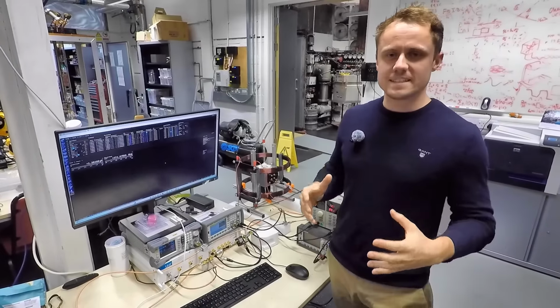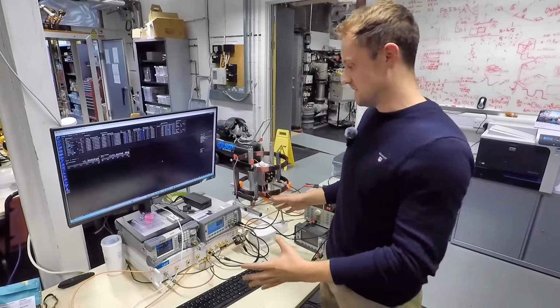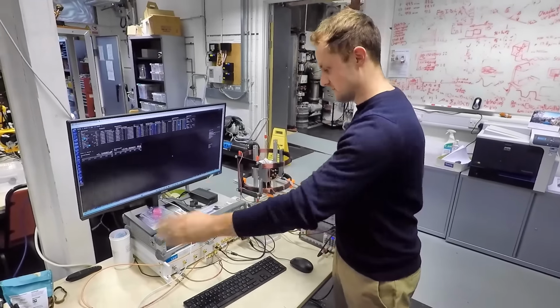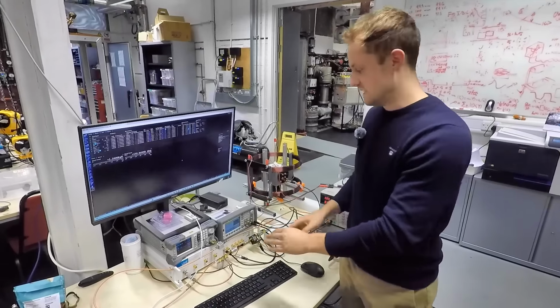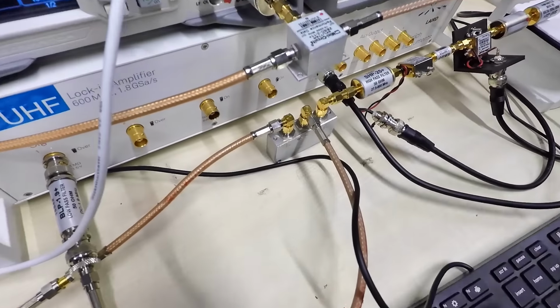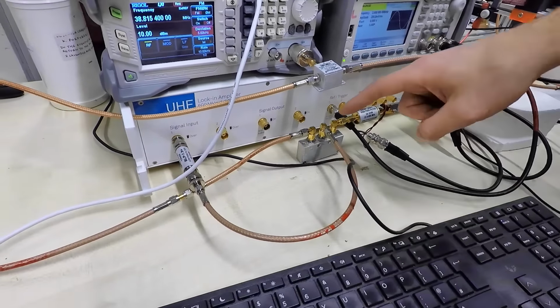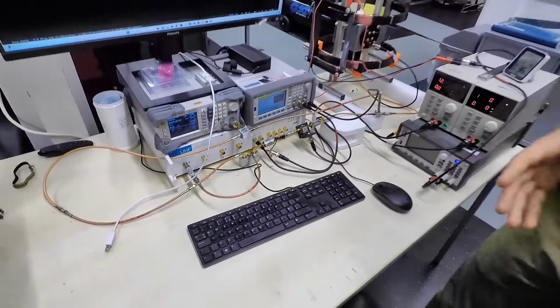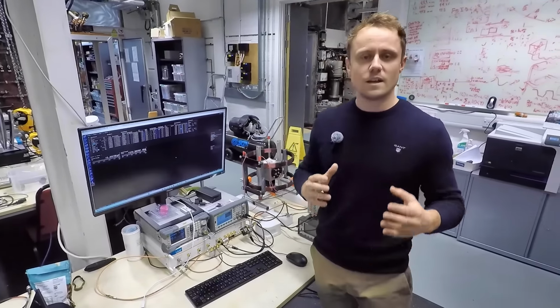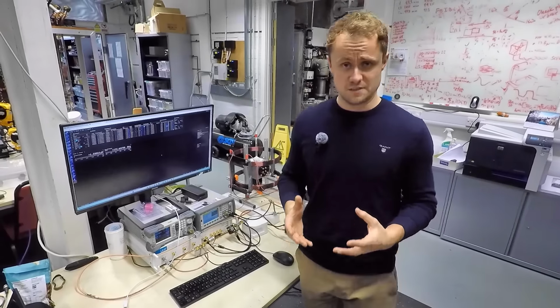Okay, so as Andrew told you earlier, we have these two branches of our circuit, both of which can carry the RF signal. One going to the experiment, which is modulated, and one going just round to the other side of the mixer, which is not modulated. When these then meet at the mixer down here, the two frequencies combine, and as a result, what you get out of the mixer on the output channel is a signal that is just oscillating at the modulation frequency. So what we're interested in is the amplitude of that signal at the modulation frequency.